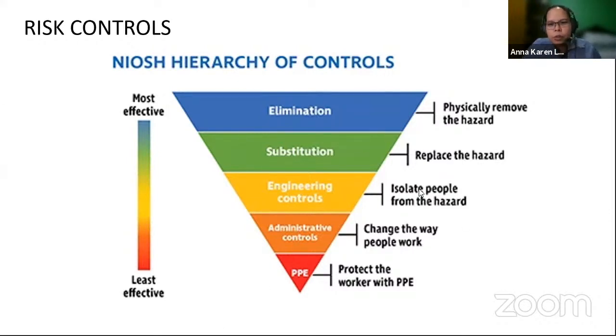Then you have BSL-2, and BSL-3 and BSL-4 are for those that are more of the infectious kinds, and especially BSL-4 is those that are really deadly, and there is no immediate or established cure or treatment for that particular infection. So yun, meron tayong mga different BSL levels.